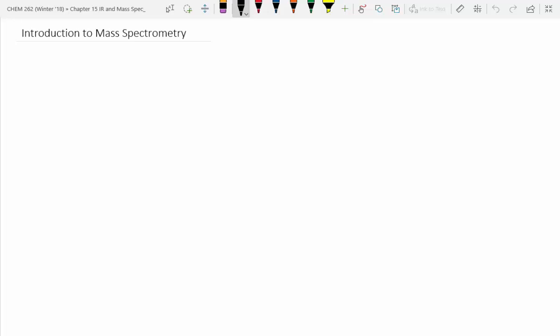So chapter 15 in the Klein textbook is split into two different topics. The first topic is all about IR spectroscopy, and the second part is mass spectrometry. We've already done a lot of IR in lab, so instead of spending lecture time on it, I made a supplemental video where if you feel a little rusty, you can go back and watch that on your own time. But the most important thing with IR is knowing how to quickly decipher what peaks you need to interpret.